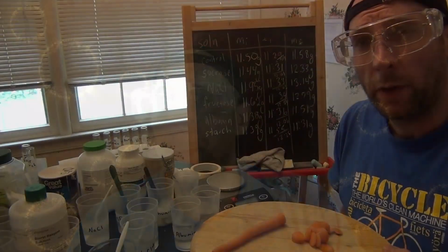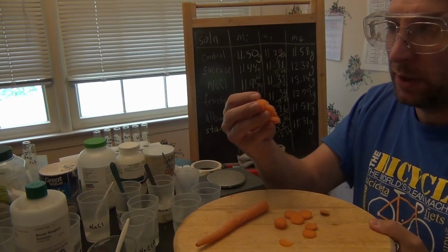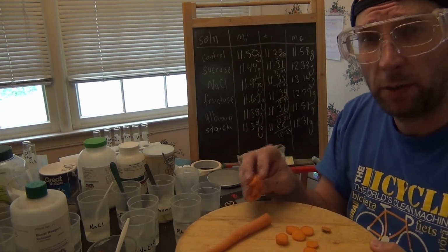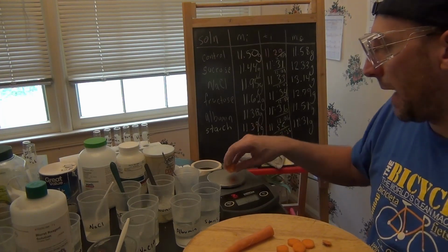I am also going to quickly demonstrate part 2. I'm not going to go through every step-by-step part of it. In fact, I'm going to use data that was collected at a different time, but I'm going to show you really quickly how it's done. For the next experiment, I'm going to take some carrots, probably 5 or 6 pieces, and other plant matter, probably some potato, sweet potato, maybe apples, and I'm going to mass them.